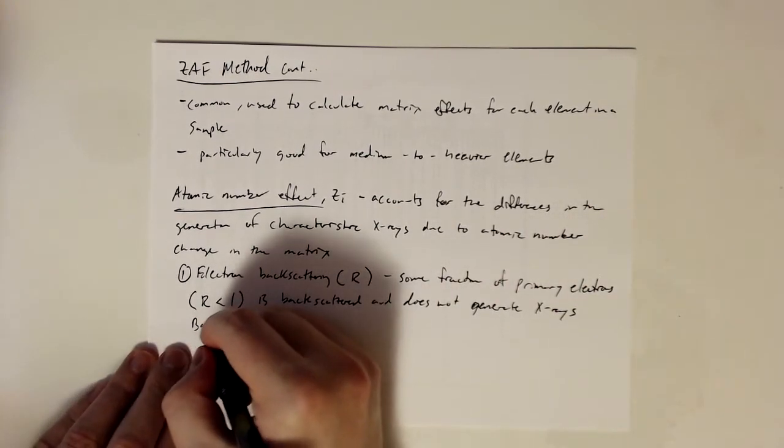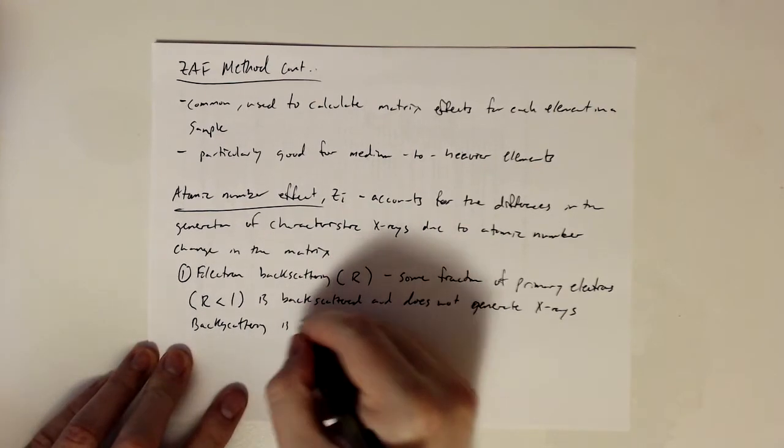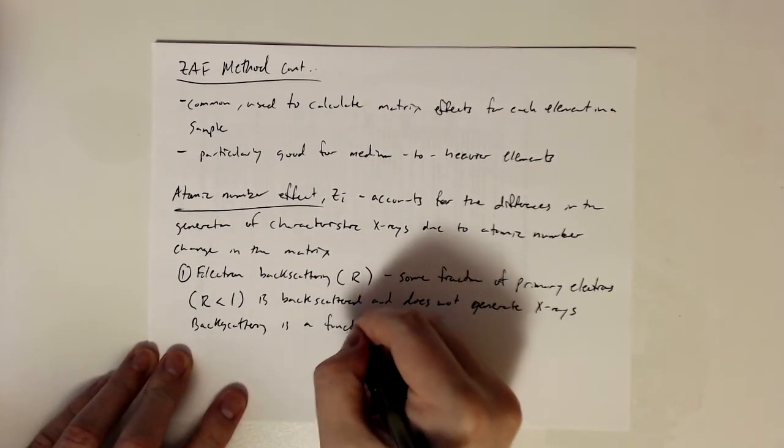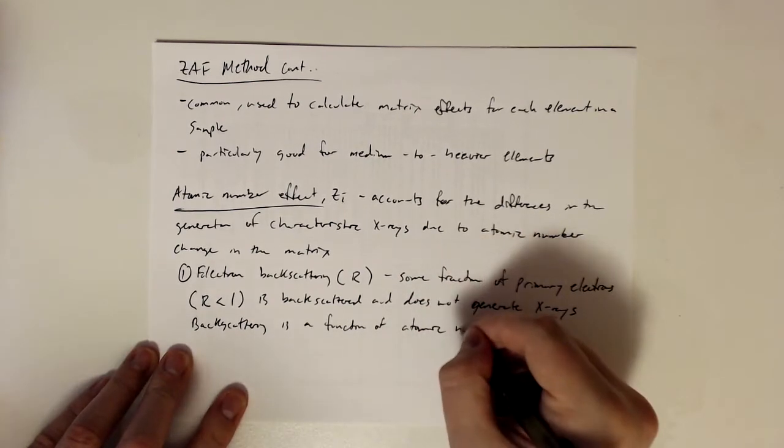This backscattering is a function of atomic number.